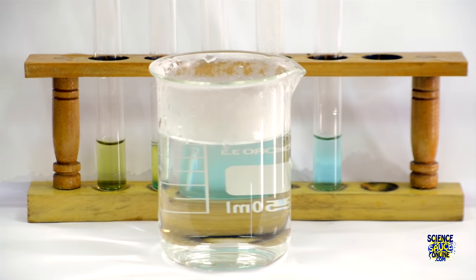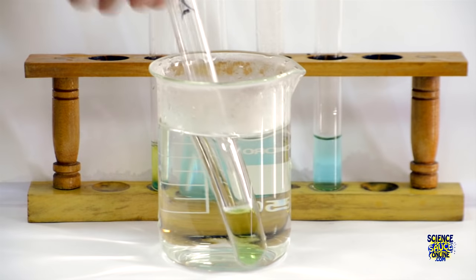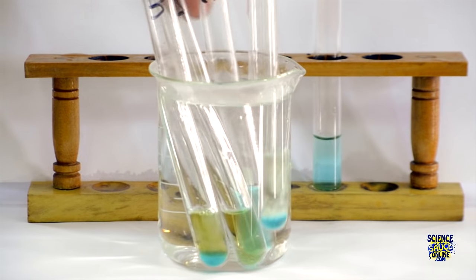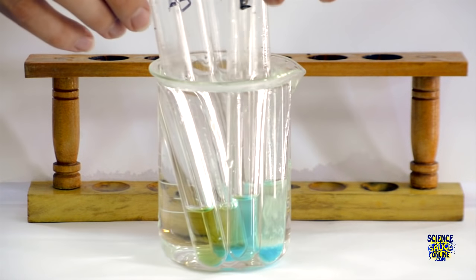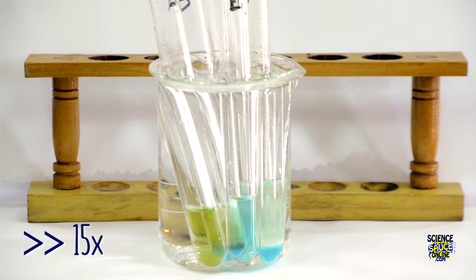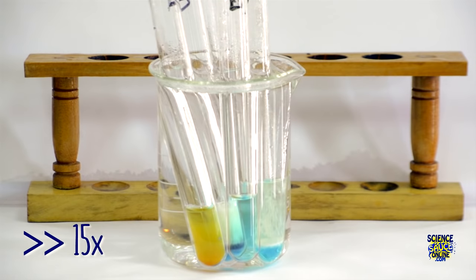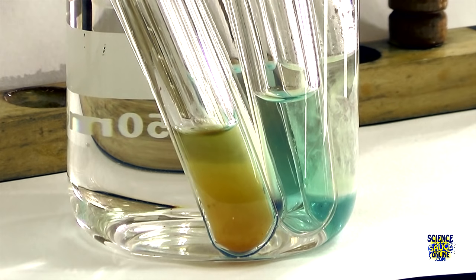Put each of your samples into the water bath and then wait for a while. It does take some time for a reaction to occur but if we watch this sped up you can see that one of our samples is clearly turning a kind of yellowy orange color. And this indicates the presence of a reducing sugar.